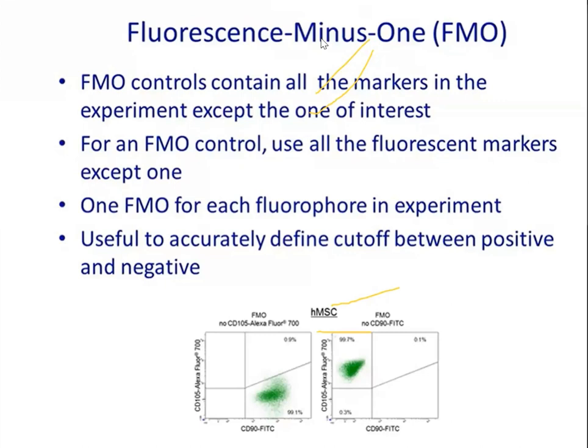So I will drop FITC alone in that. I will not add any other fluorochrome because these are only single stain controls. So I need to take 10 tubes. If I'm using a 10 color flow cytometer, I will take 10 separate test tubes and add beads into all 10 tubes. Then I add FITC in the first tube, PE in the second tube, ECD in the third tube. ECD in the sense antibody tagged to ECD. The fourth is antibody tagged to PC5.5. Similarly, I add all the antibodies tagged to the respective fluorochromes to the 10 tubes, and then I acquire all the tubes one by one and see whether any non-specific signal is coming in the other channels. Is that clear, Dr. Anand? Yeah, your side is fine.